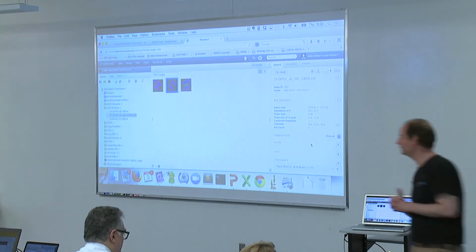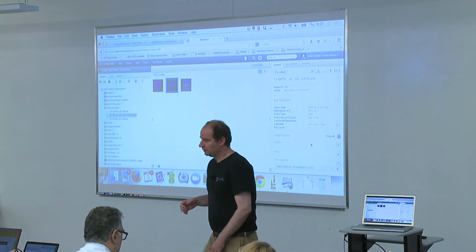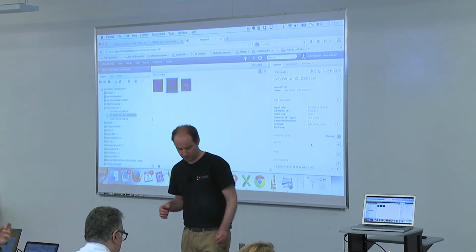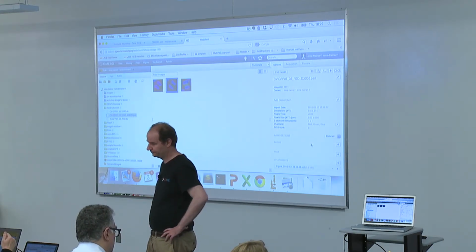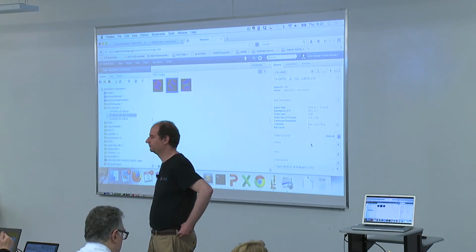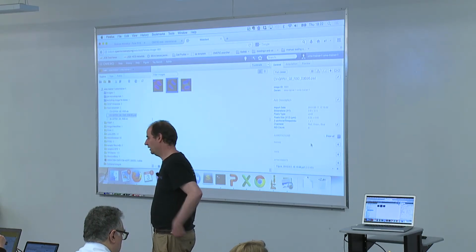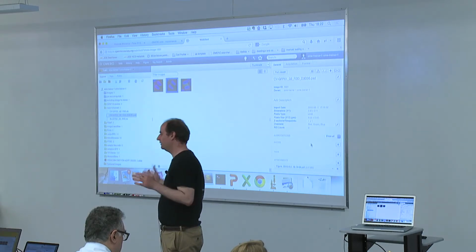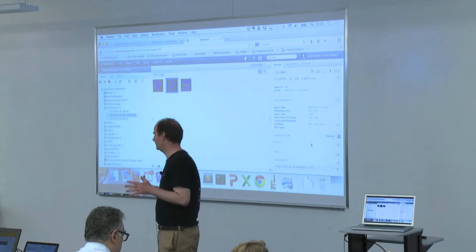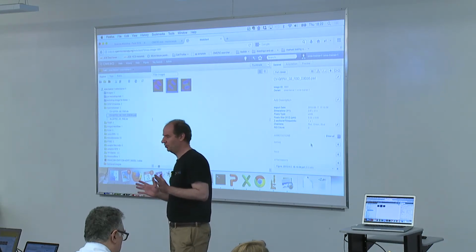Yes. You know that the original metadata has an error. For example, if you have an objective in the wrong position and the wrong metadata was reported, is it possible to correct that, or are you always? Yeah, well, no. The thing is, why not?